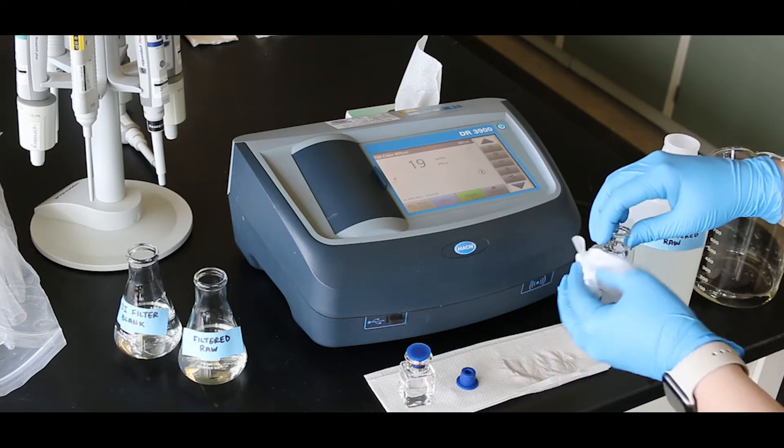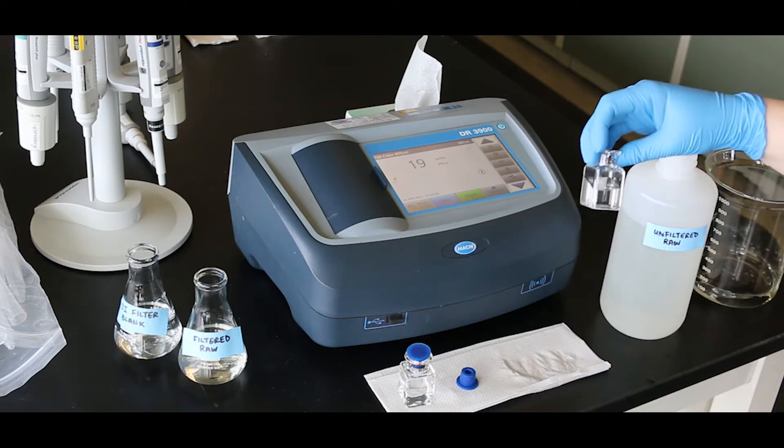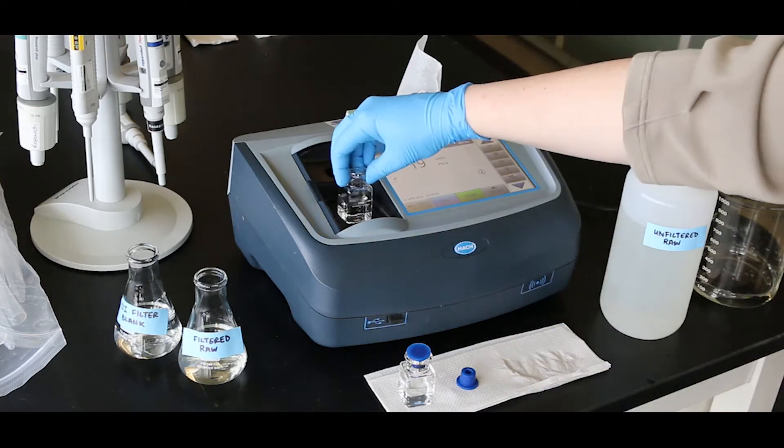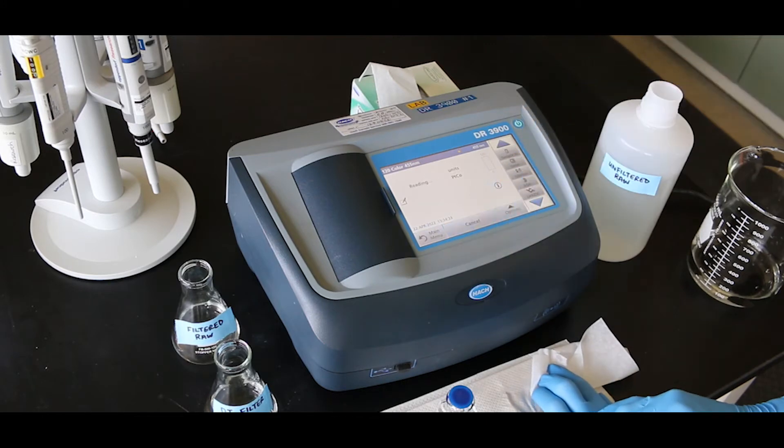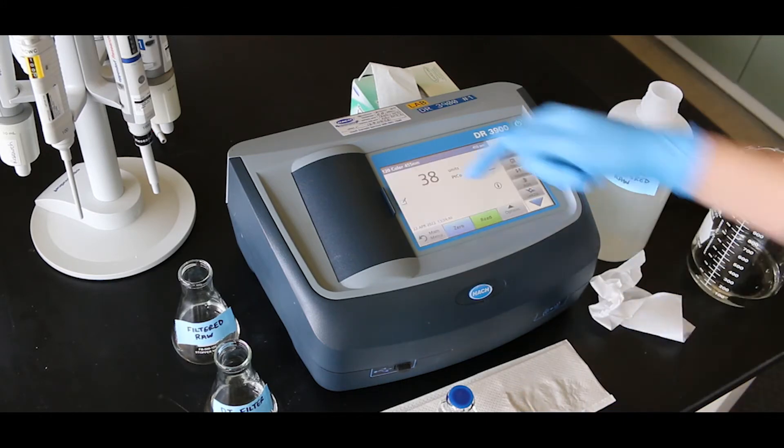Clean the outside of the sample cell and insert it into the instrument. Press read. This value will be your apparent color measurement. Record the results in platinum cobalt units.